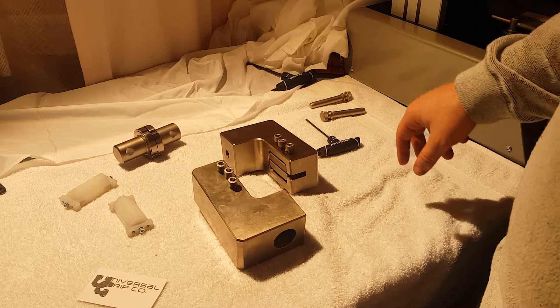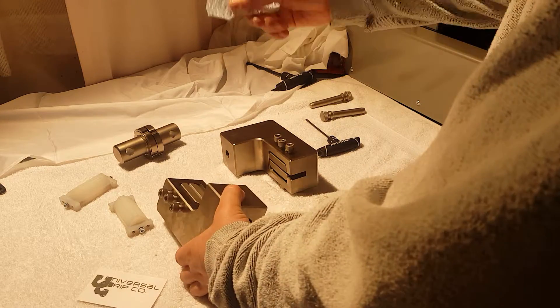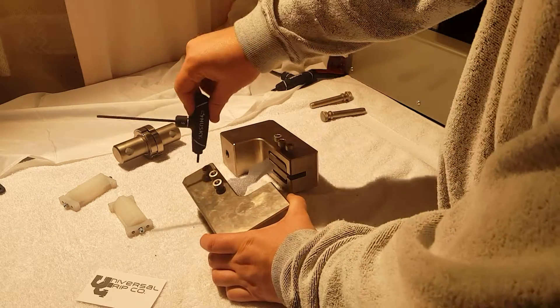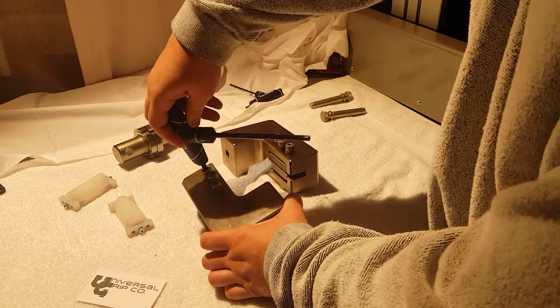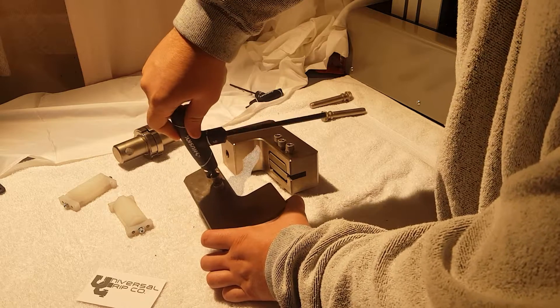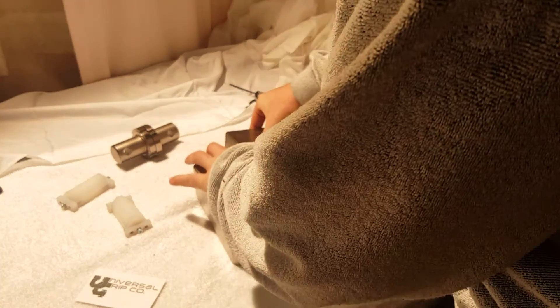Before you run this test, make sure to read through the full ASTM publication. That will tell you exactly the size of the sample you need and other useful information like how fast to run the machine. But today we're just going to focus on the grips. So once we have the sample in place we'll go ahead and tighten the screws on both sides.